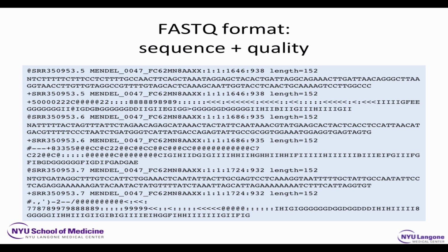It seems like all of these have an N in the first position, so there might have been some sort of artifact involving a primer, or the way the library was prepared. For some reason, there was a tail of a restriction enzyme, and every molecule had the same starting base, which will confuse the system since it's expecting roughly 25%. When you take all the different positions into account, all the different molecules, they shouldn't all start with A.